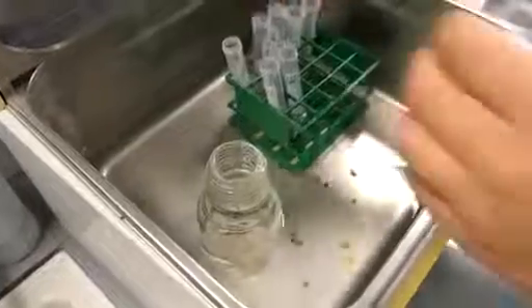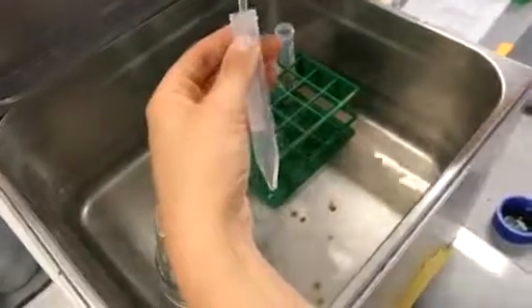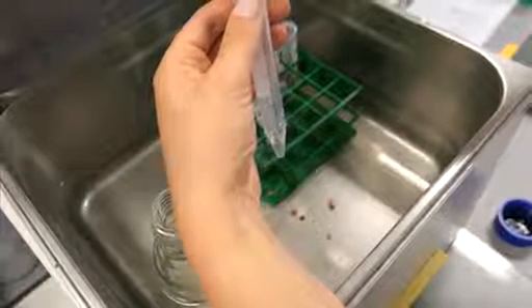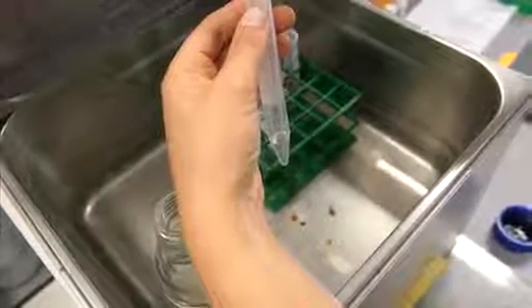Keep the tubes at at least 40 degrees centigrade or higher to prevent the PVA from solidifying. One milliliter of PVA solution is good for about four cytospins or two tissue preparations.